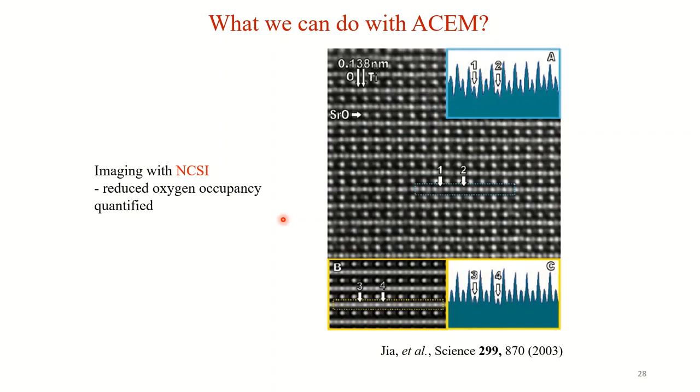And the application of that is, especially in situ transmission electron microscopy, the people who are working with catalysis often deal with water splitting reactions and carbon sequestration, conversion of CO2 into fuels, which involves low Z elements, including oxygen, hydrogen, or if you're imaging some boron nitride or gallium nitride stuff, then you have to locate the low Z elements. And in that case, this NCSI imaging was very useful.